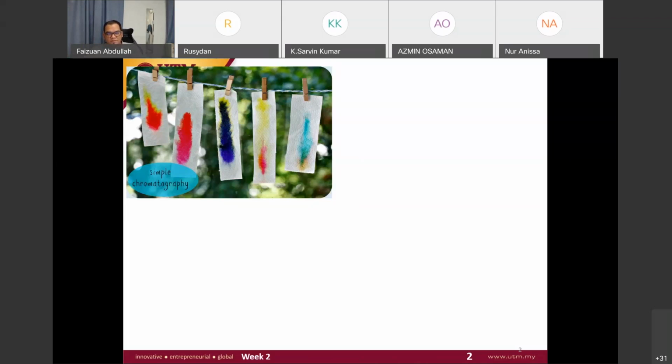It doesn't matter if it is natural, such as a fruit that has colors. What kind of fruit has really intense colors, such as dragon fruit, or anything that you put at the very end of the tissue. You cut the tissue in the shape of a rectangle, and then you put at the very end of the tissue a simple dot of the coloring solution, and then you will see all those things. It's moving, right? It keeps moving on the tissue. Am I true?